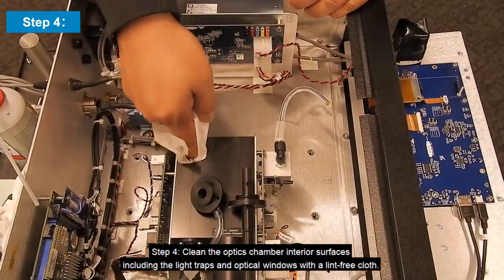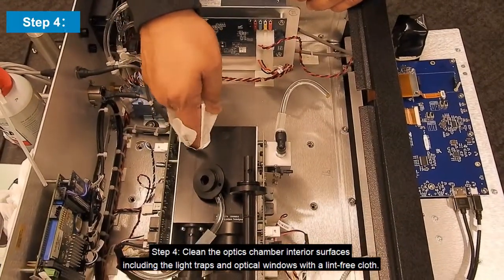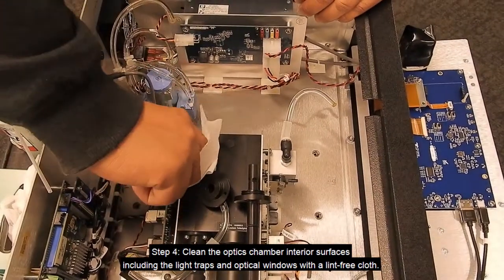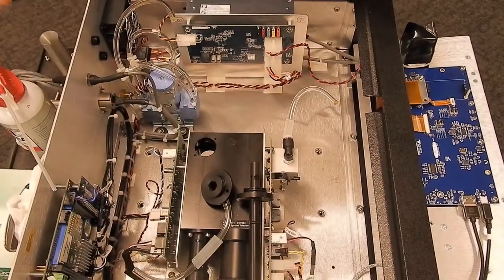Step 4: Clean the optics chamber interior surfaces, including the light traps and optical windows, with a lint-free cloth.